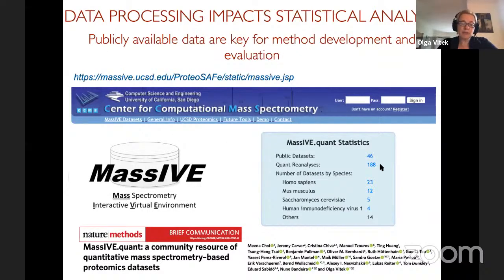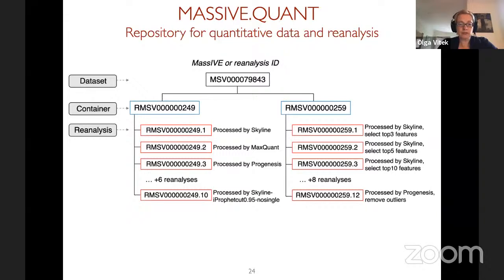And the reason why I'm talking about that is because all these data sets have R scripts or some other analysis types associated with this data. You can work with more than just the iPRG dataset that we present here, but we also hope that you can submit your own data and your own analysis or just reanalysis of the existing data to this repository. So it is not designed for us to store the data, it is designed for anybody to use and anybody to contribute the data to this.